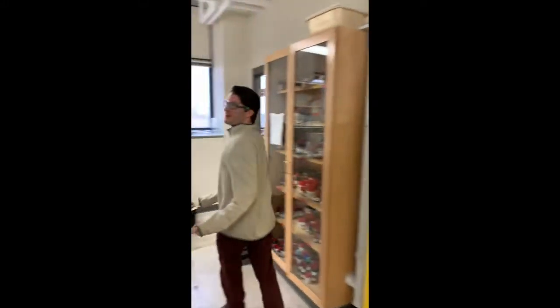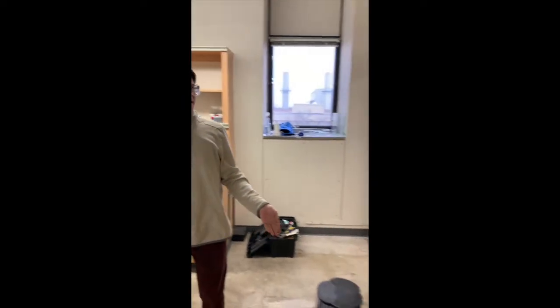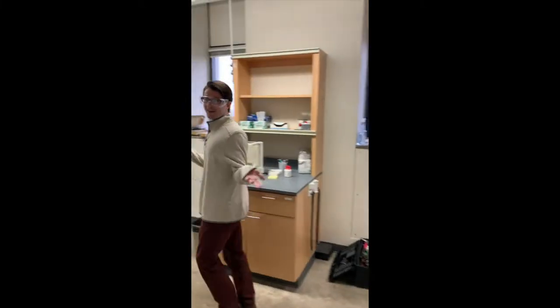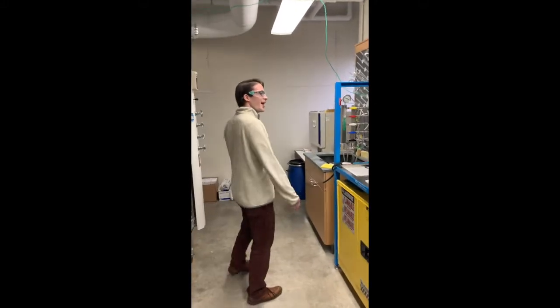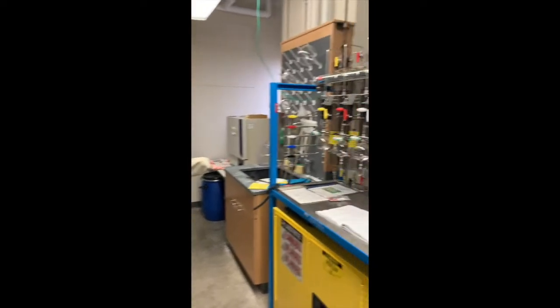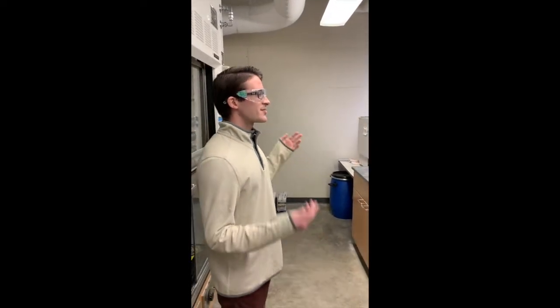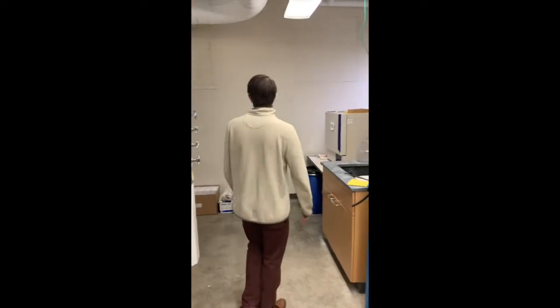But throughout all the labs, we have our chemical inventory just kind of spaced around. This is one of our chemical inventory shelves. And since the lab has been here for like 15 years, we have a pretty good inventory of chemicals right now. One really nice thing that we have in the lab is the solvent system here. And these are 5 of our most commonly used solvents, especially for photochemistry. And so it's super nice to have this just right in the lab. It's really quick to access, and it's a quick, reliable source to dry solvents.